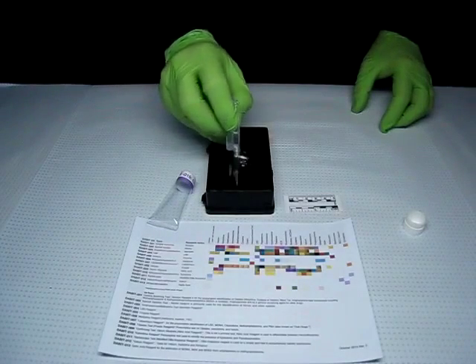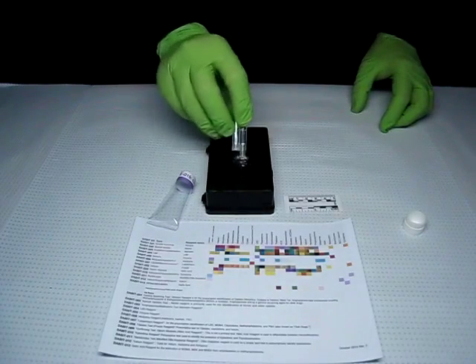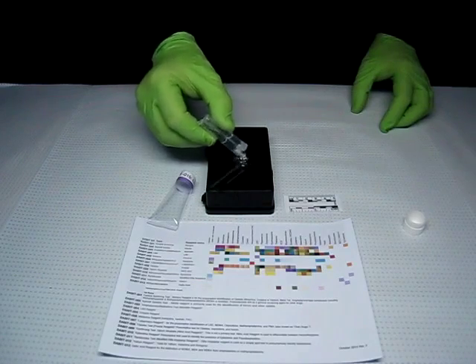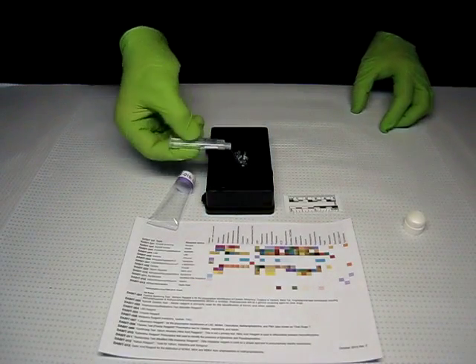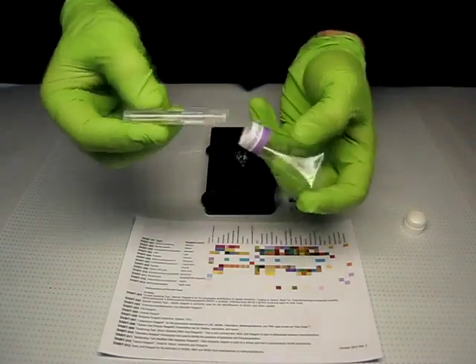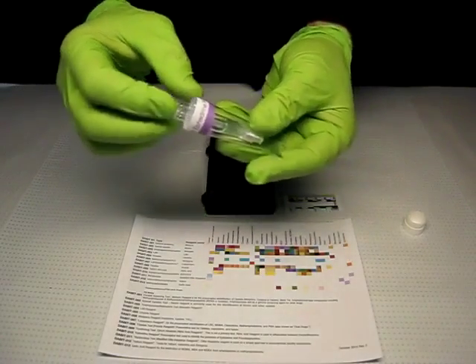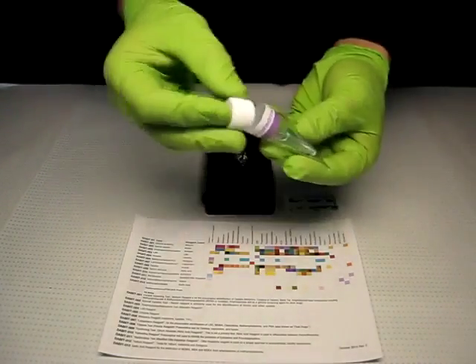Return the sampler to the clear inner tube, sample tip first, and replace the cap. Squeeze to break both ampules inside, expelling all of the liquid into the bottom of the tube.